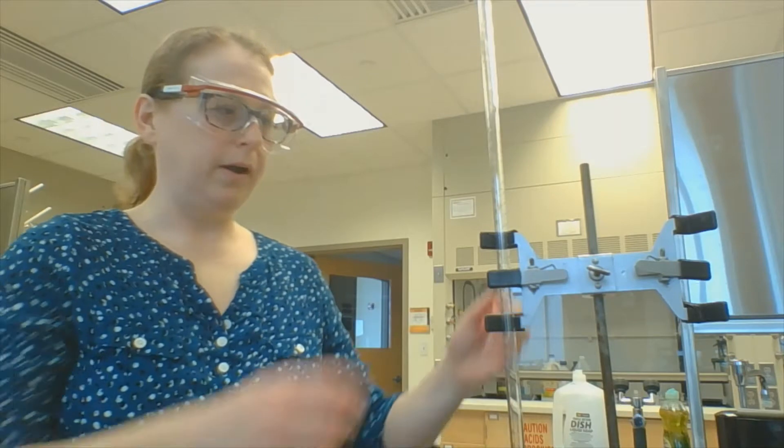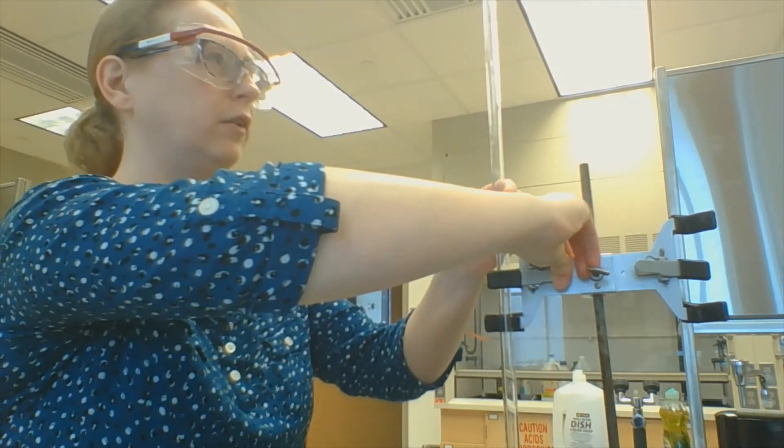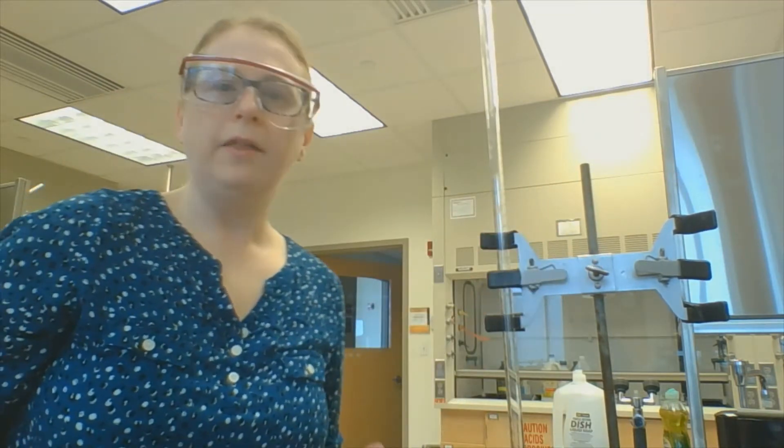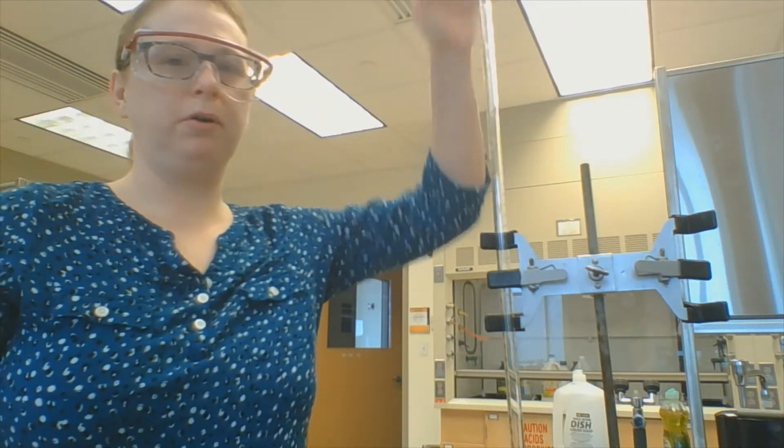The next thing I do when working with a burette is fill it. You never try to fill it by pouring above your head, so I always lower my burette as far as I can. Then I remember I have a funnel at my disposal — why try to pour into that little tiny top space when I don't have to?